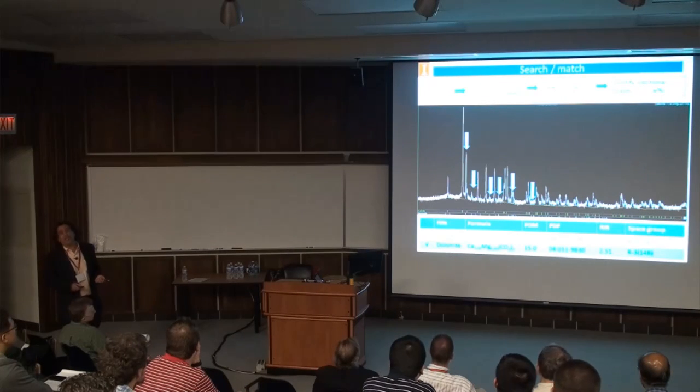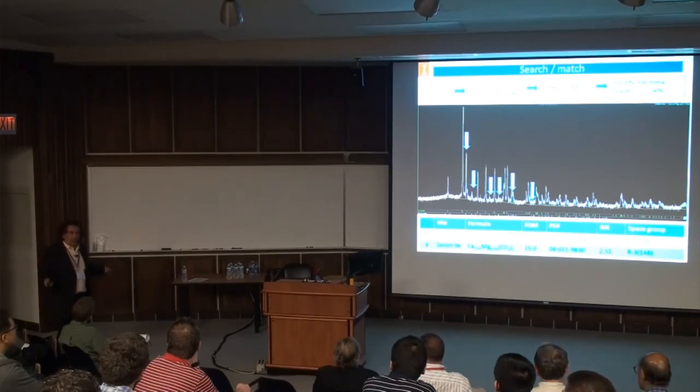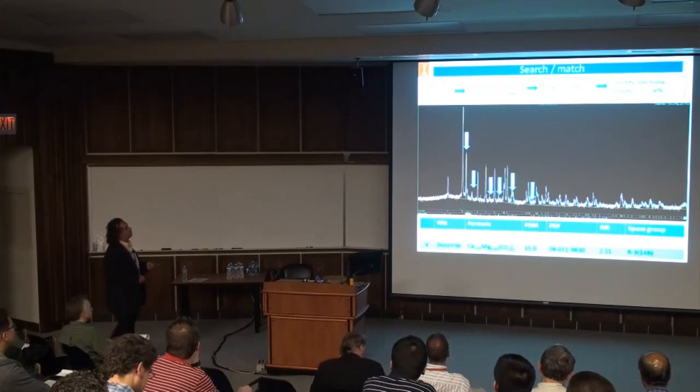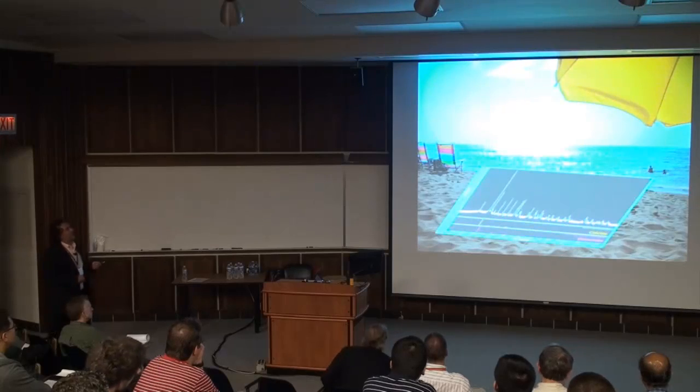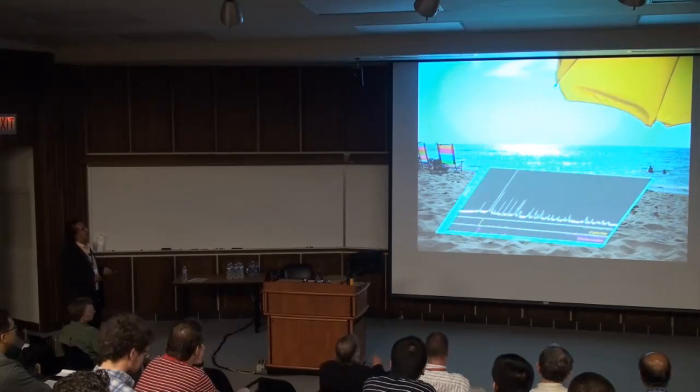You could really be in a nightmare situation where you have 4, 5, 10 phases. People in the cement industry have lots of phases to work on in that particular analysis. In this case, to make it simple, just 2 phases. So what next? We identified what is in that sample. What is present is surprisingly simple.